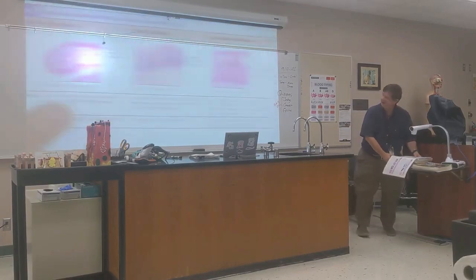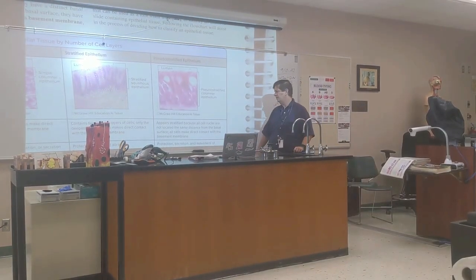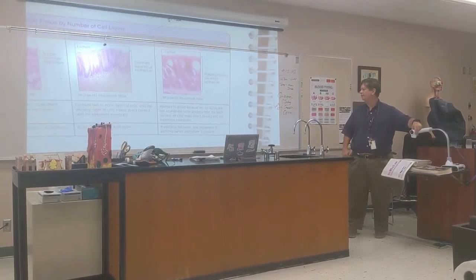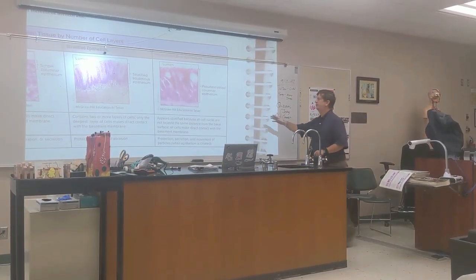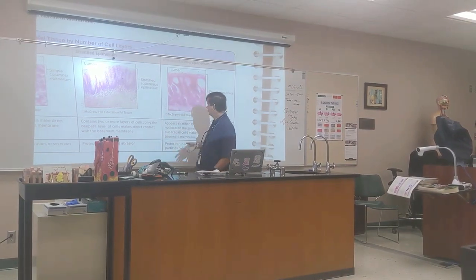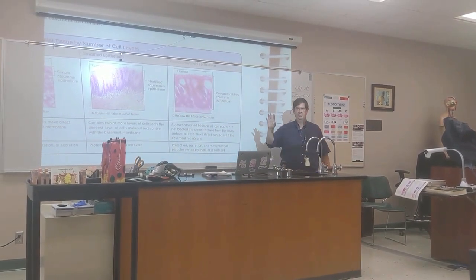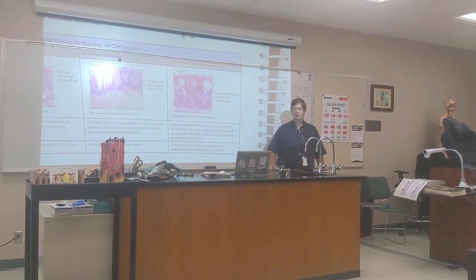Okay. Here, I'll take your lab book and put it right there. Pseudostratified columnar epithelium: protection, secretion, and movement of particles when the epithelium is ciliated, as it is with all the cilia sticking up in the lining of your trachea. Good? Right. So location, trachea; function, protection, secretion, movement of particles. Are we good?